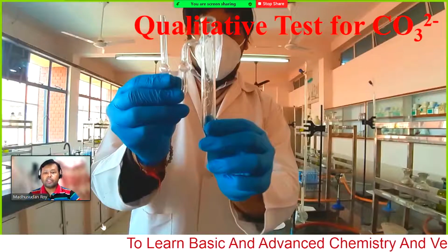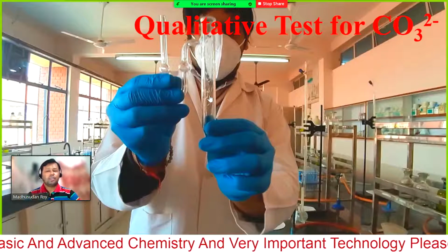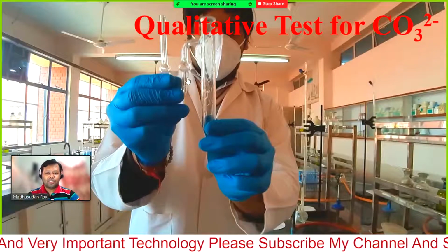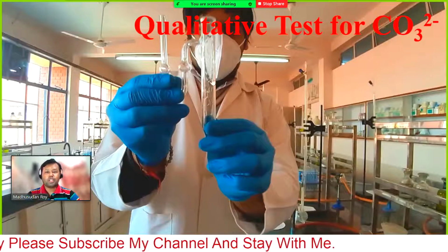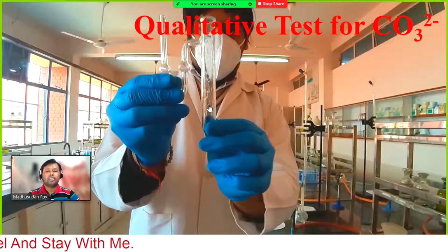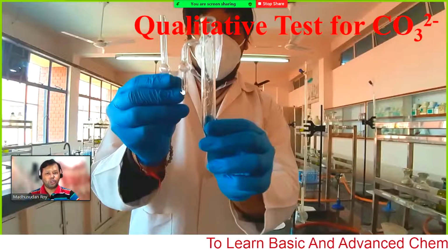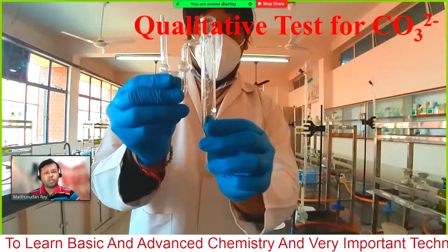Today I am showing you a good instrument, but the observation is not very good here. You may not observe a very good change or turbid color. I think they didn't add a sufficient amount of acid, or the time was not enough, or they had some difficulties. Maybe in this video you cannot observe the turbid color. However, I did it myself and I could observe it. But this instrument is even better.